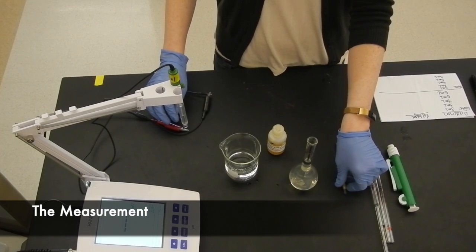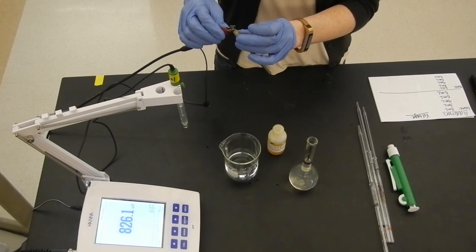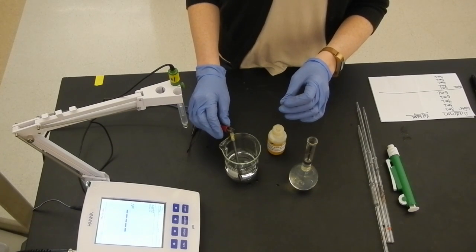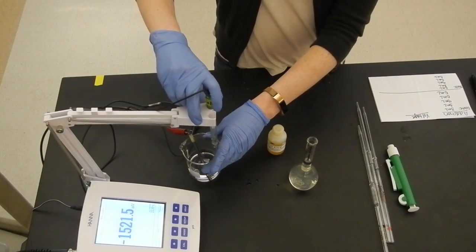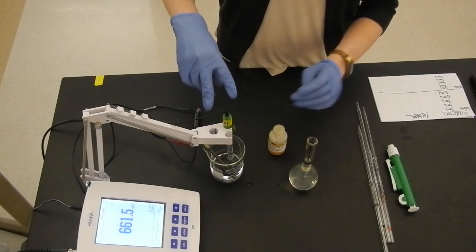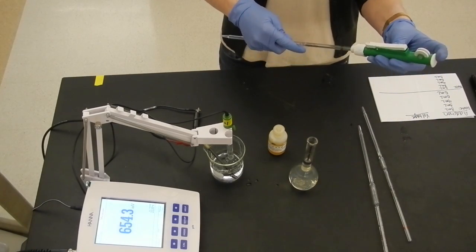Now we are ready to start making the measurements. For this reaction, a graphite rod is used. The graphite rod is connected to the reference electrode through the voltmeter. Once both the graphite and reference electrode are submerged in the reaction beaker, we have a complete circuit where electrons can be exchanged between the cathode and anode, or oxidation and reduction reactions.